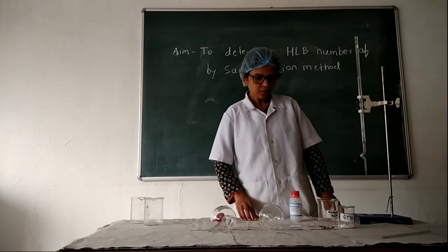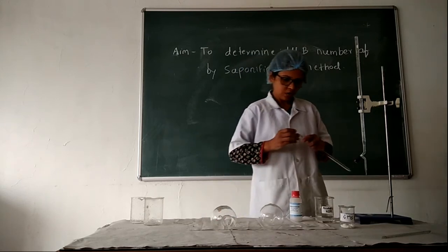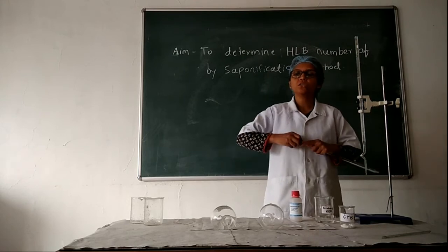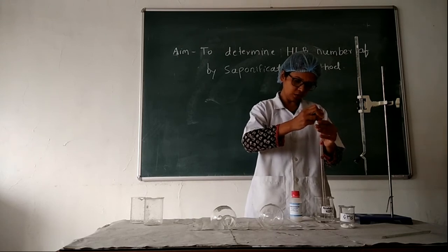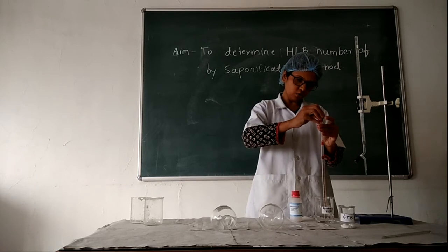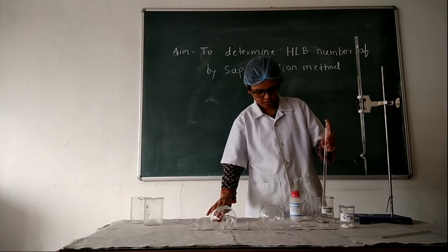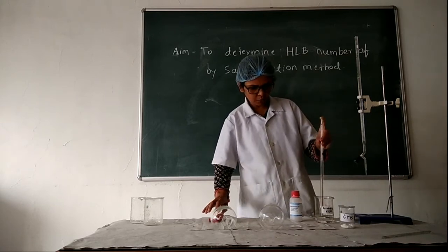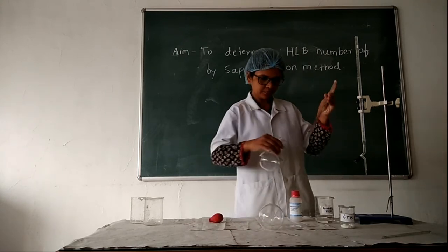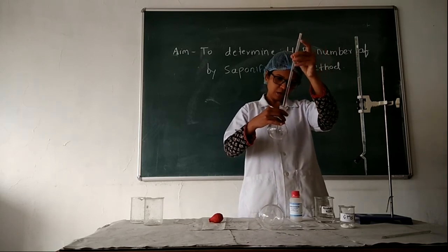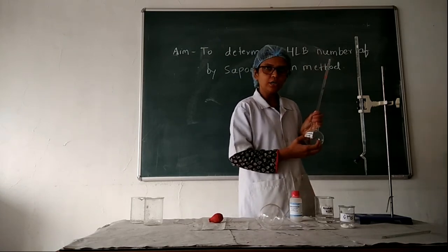Now, first of all, I am taking 15 ml of alcoholic KOH. To prepare alcoholic KOH, take 4 grams of KOH into 2 to 3 ml of water, then make up the volume to 100 ml with ethanol. Allow it to stand for 24 hours and then use the supernatant. I am now transferring this alcoholic KOH into the round bottom flask labeled as alcoholic KOH.